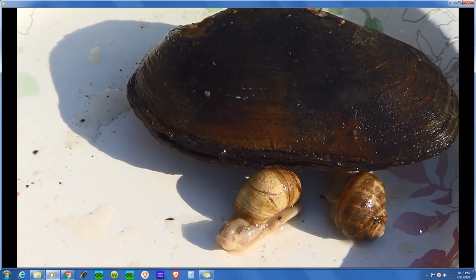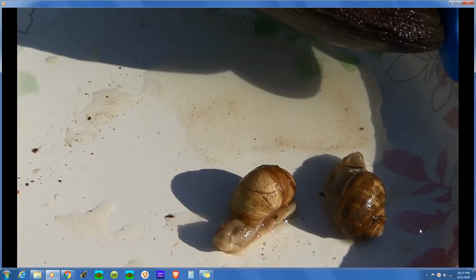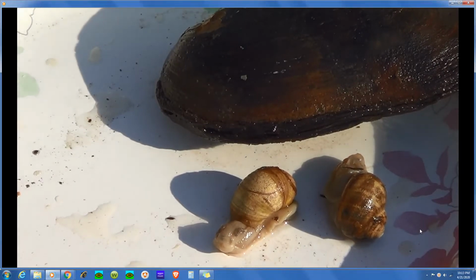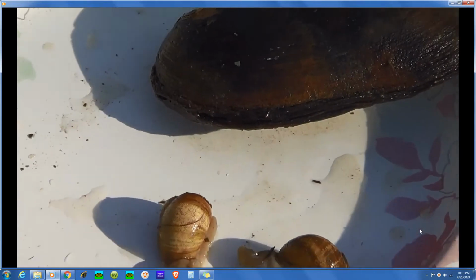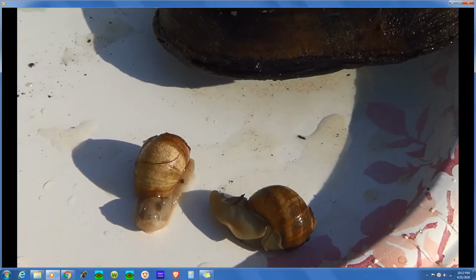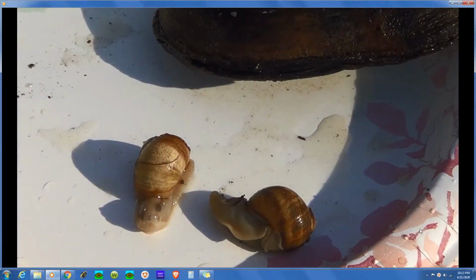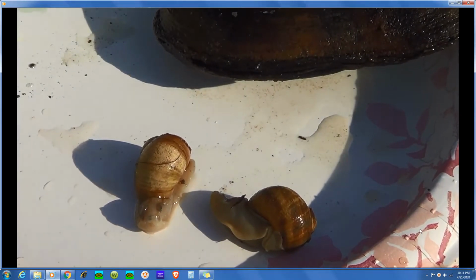And then you have your head foot. Now, in the case of your mussels, there isn't so much a head. There's not much cephalization in the bivalves, the class Pelecypoda. But the snails are highly cephalized, and the cephalopods, the squid and the octopus, are also highly cephalized. All right, so the chiton, not so much. The chiton is, like I said, a very primitive form. So we're going to look at the anatomy of these three types.